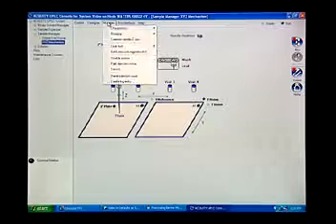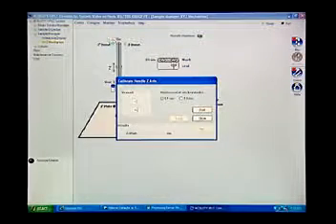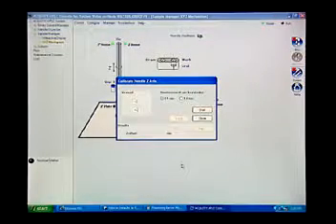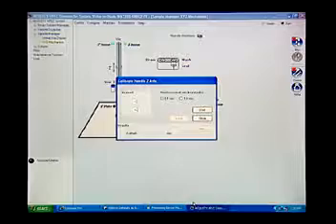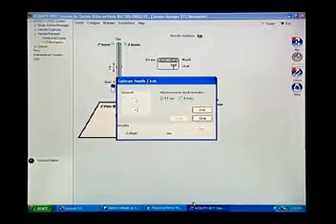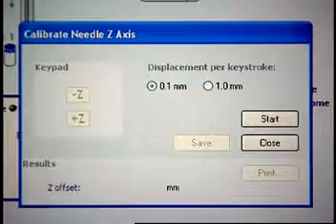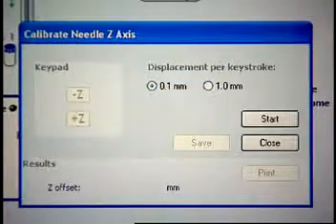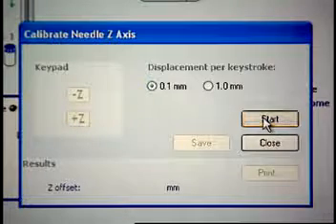Next, click Maintain, Calibrate needle Z-axis. The Calibrate needle Z-axis dialog box appears. Calibrating the needle Z-axis positions the sample needle relative to the bottom of the vial.